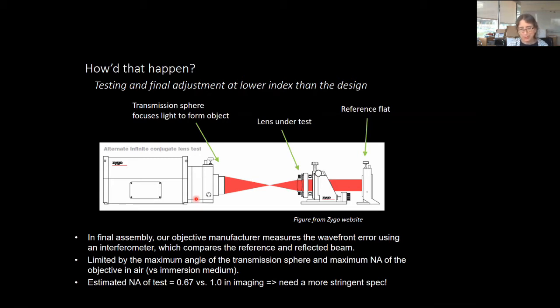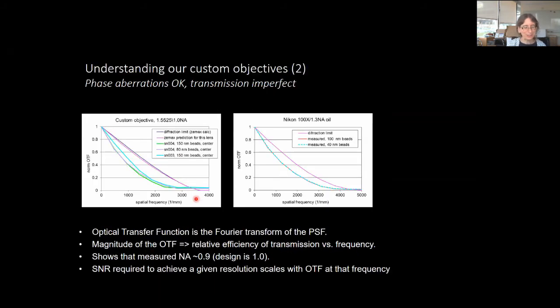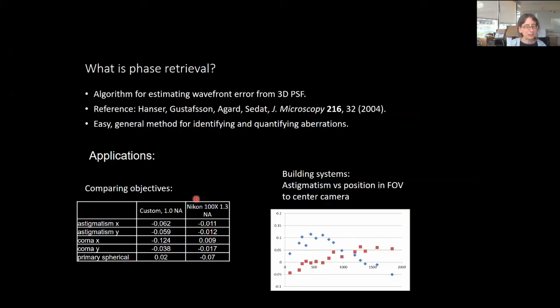And so they knew how to do the optical design. They're smart. They're a perfectly good optics shop. But we had pushed them beyond their limit, and none of us realized just how far we had pushed them beyond their limit. And the reason why it was a difficulty is nothing is linear with NA. And so 1.0 NA is profoundly different from 0.7. Yep. And that's the other sort of lesson from that.